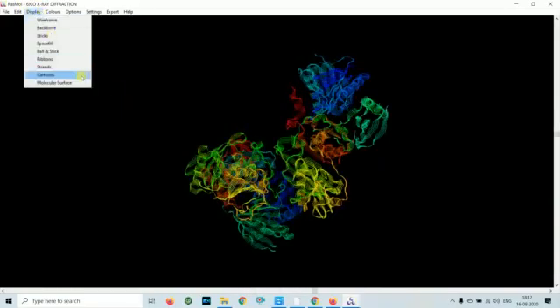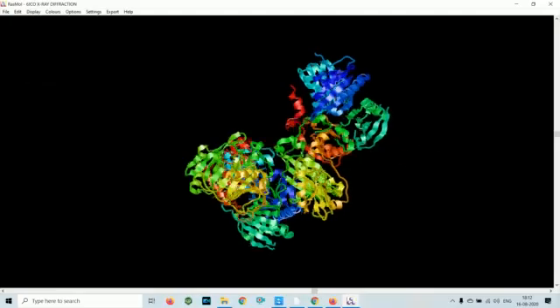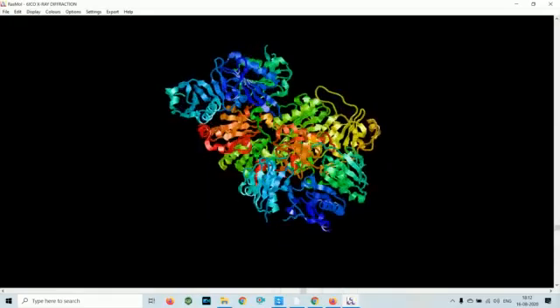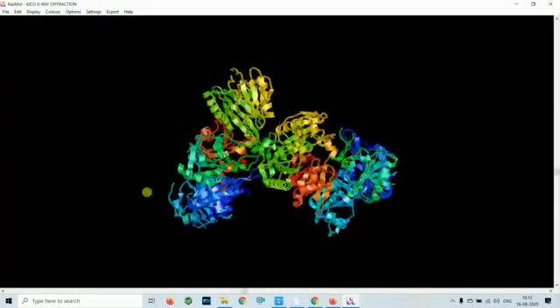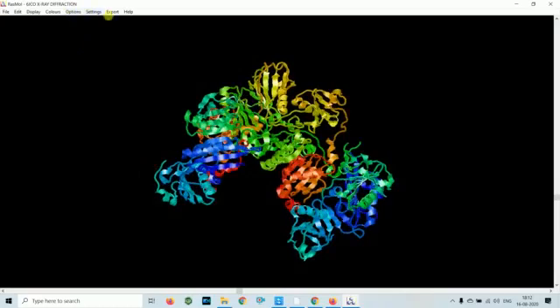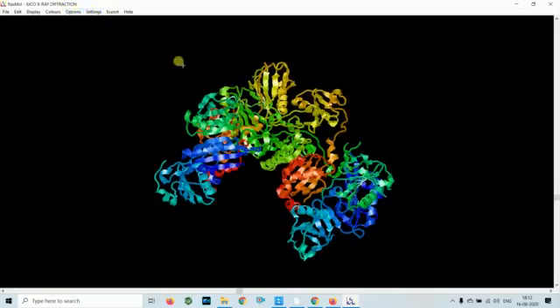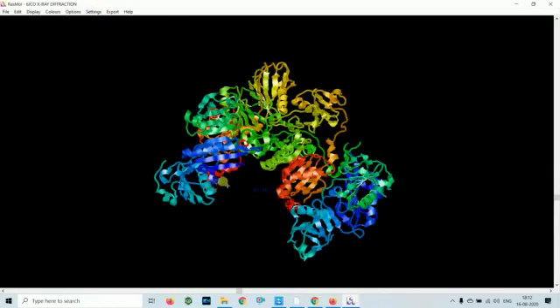Like, you click here and click here, so it will give you the distance between these two atoms.